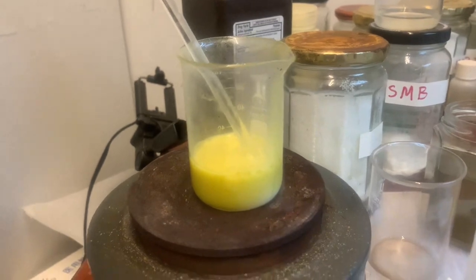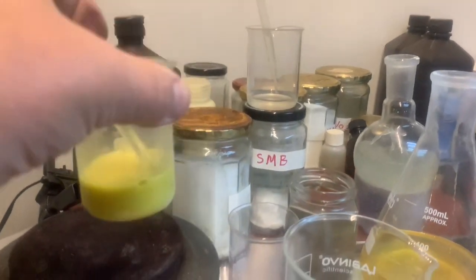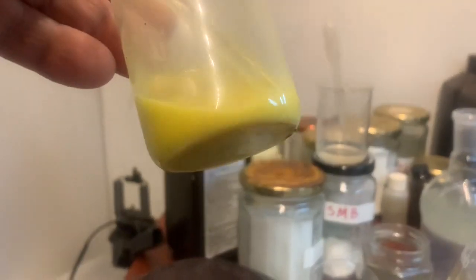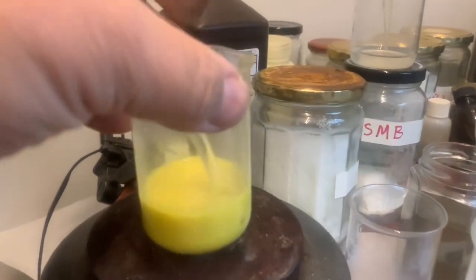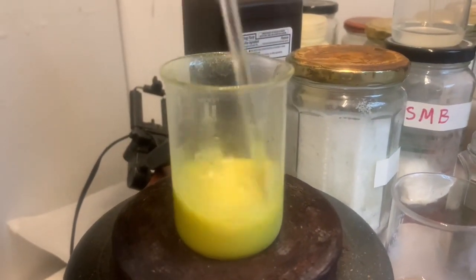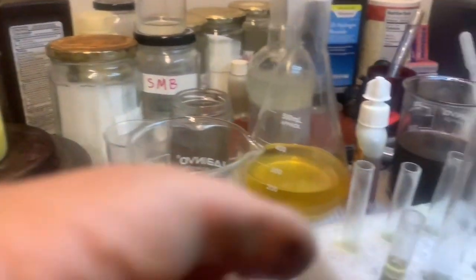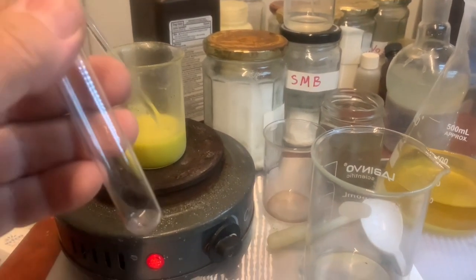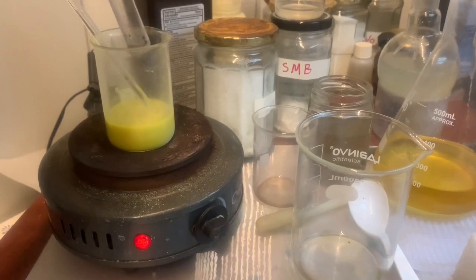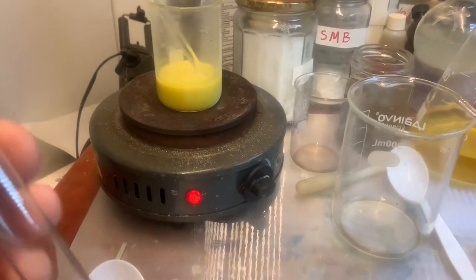So right now, like you see, everything dissolved, but it's very ugly looking. So let's heat a little bit and then we start filtrating. I need to wash this beaker. There's some little amount of gold, but this is nothing. Okay, it's nothing. I go wash the beaker first. And then we start filtrating.